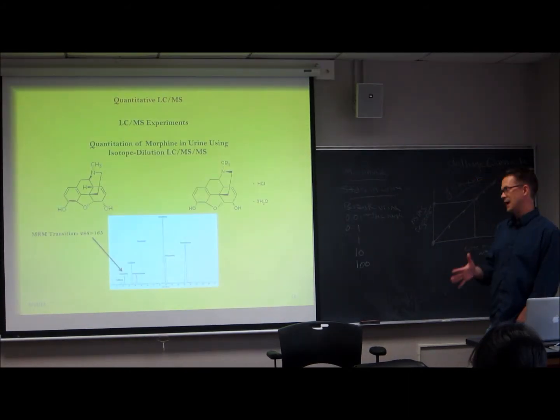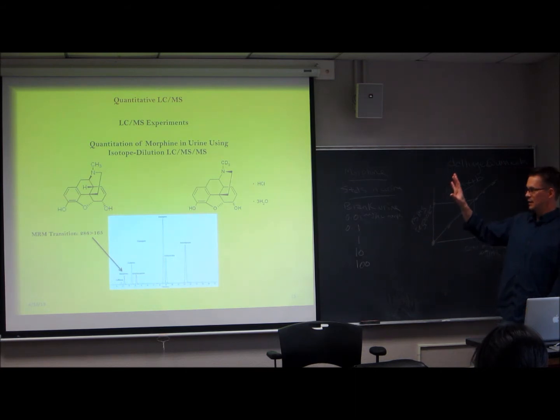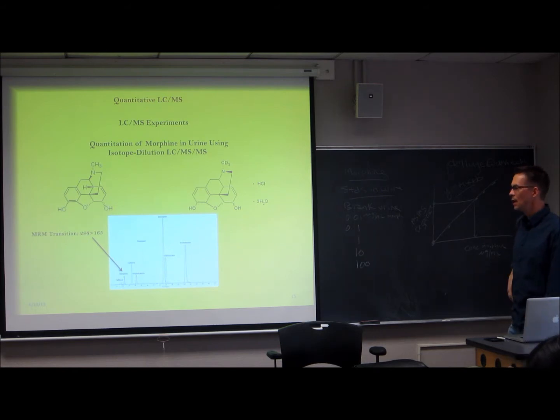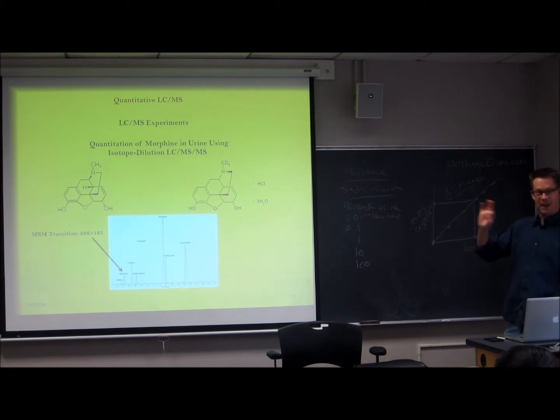And the gold standard internal standard for doing MS/MS is getting the identical compound that you're quantifying that's isotopically labeled, stable. So either deuterated or N15 or C13 labeled version of the compound you're interested in quantifying, because it's going to chromatograph identically, its mass spec behavior is going to be identical. The only difference is there's going to be a mass shift.